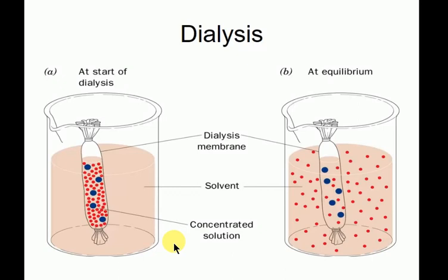That matters if you're working on membrane proteins where you've got detergent in your solution, because detergents are massively expensive. So sometimes you do small-scale dialysis rather than large-scale dialysis. You get your protein into a defined salt concentration.